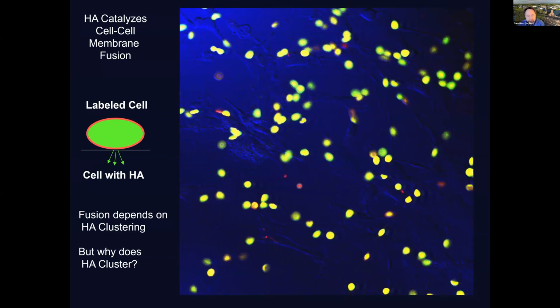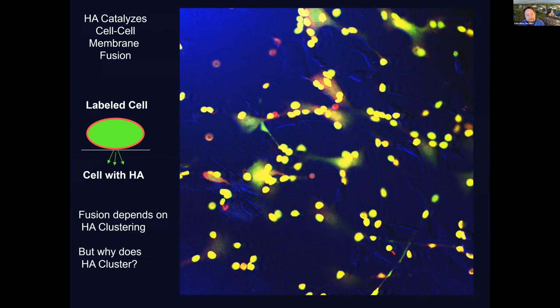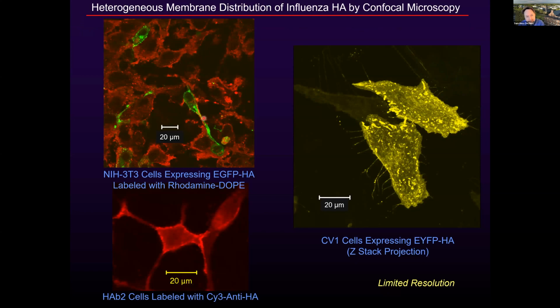Yet, this is conventional microscopy and has very limited resolution of the HA clusters themselves. You can kind of barely see heterogeneity on the edge of the cell, and in this case, very little heterogeneity. In this case, you can see some clusters, but many of them are too small to resolve. So conventional fluorescence microscopy doesn't have the resolution that's needed to see what's going on at the molecular scale. And this was a big motivating factor when I was a postdoc at NIH and learning about flu, that we needed better kinds of microscopy.